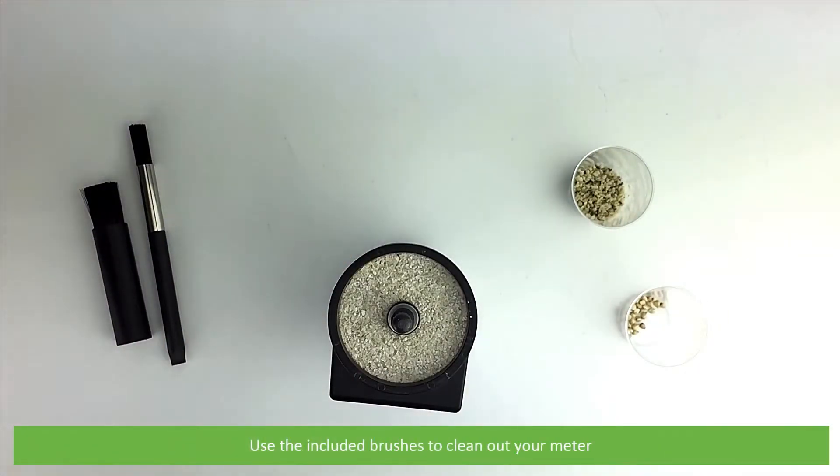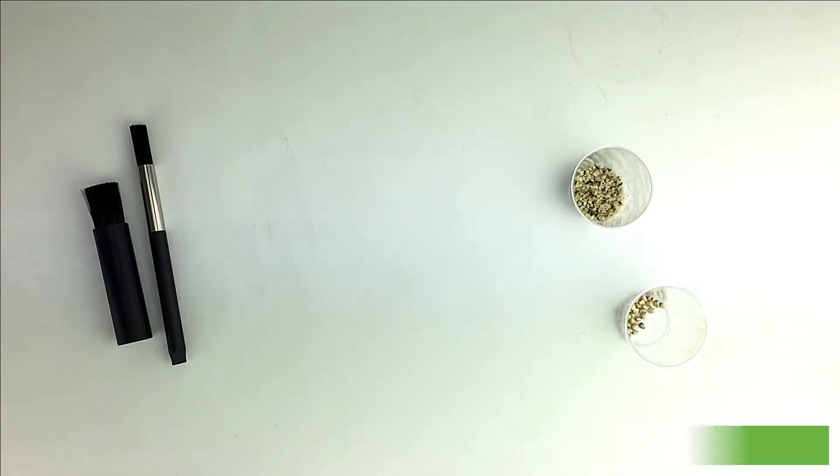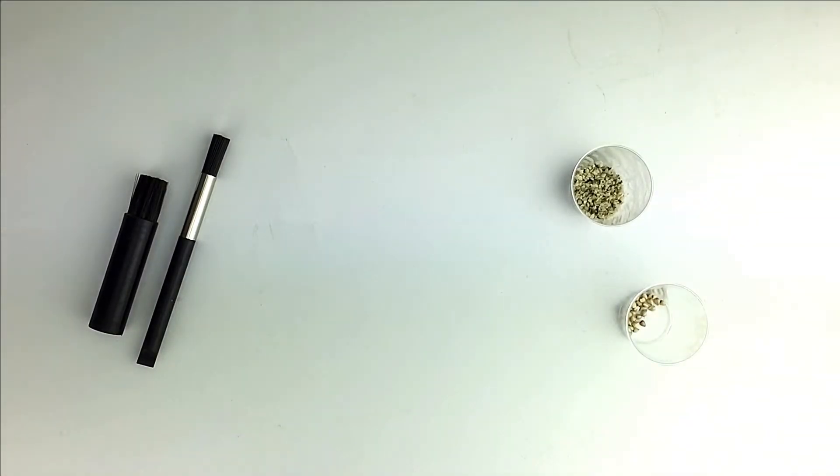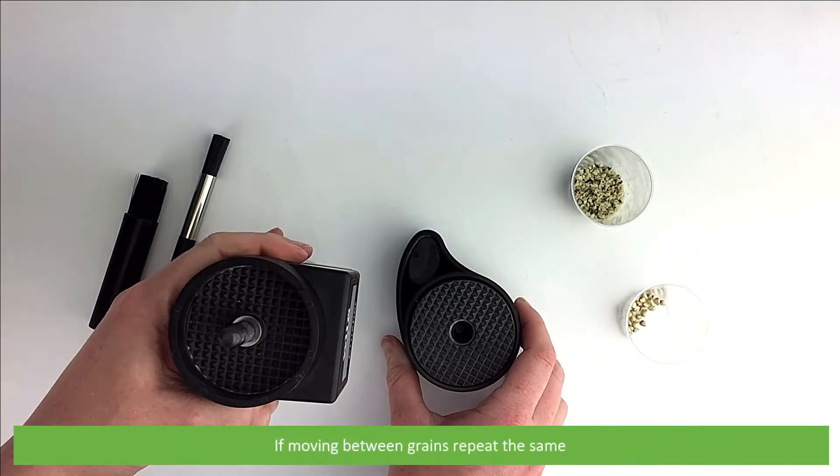Use the included brushes to clean out your meter. If moving between grains, repeat the same process.